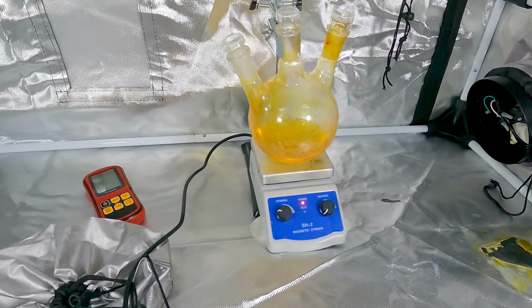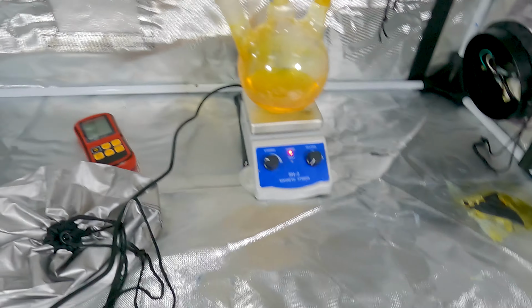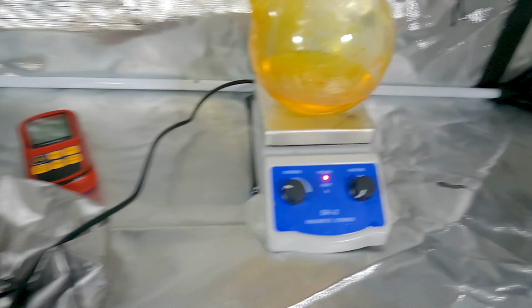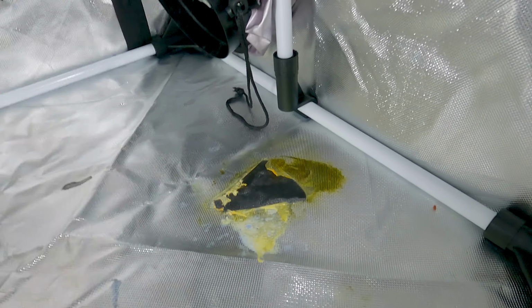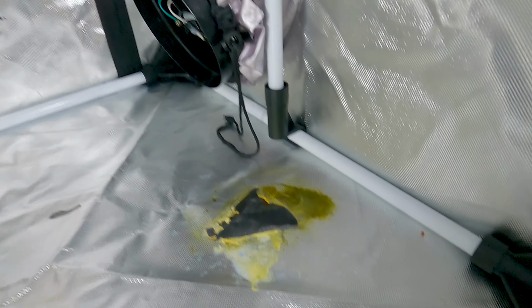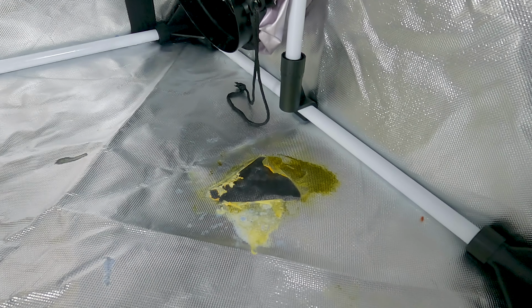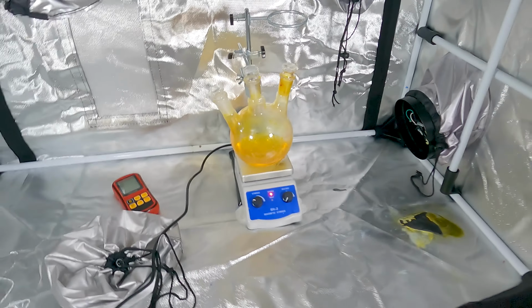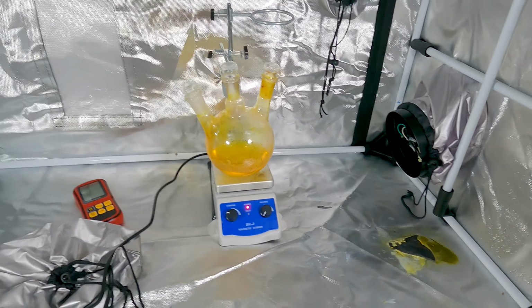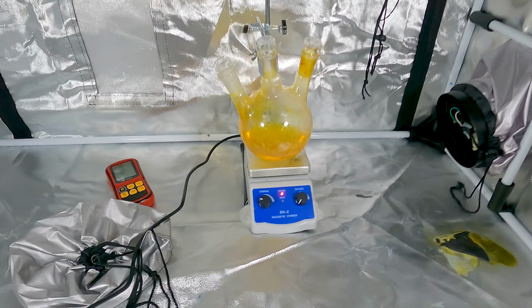We are done with brominating our product. She looks pretty good. Had a little accident over there. That's okay. That's what the thing is for. And it did its job pretty well. This top layer seems to have not agreed with the bromine mixture, it looks like some type of plastic, but the bottom layer is holding nice and strong, that black layer. I'm glad that actually happened so I could kind of test the resistance of this damn thing.